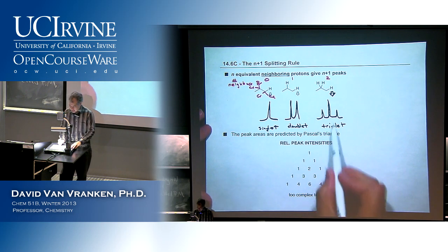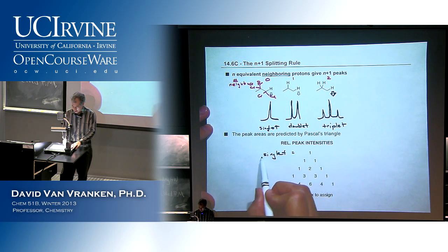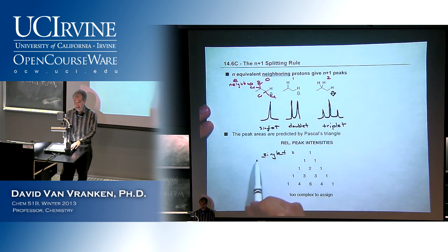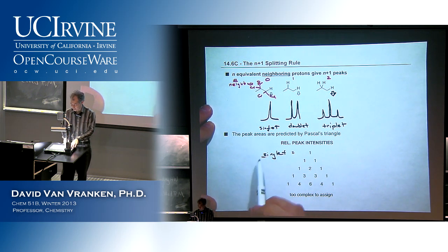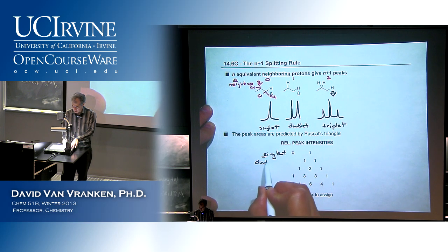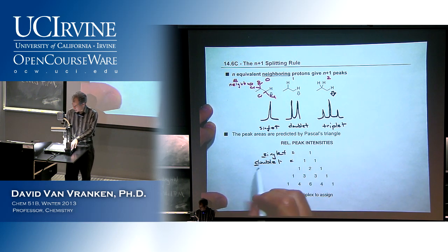Okay, so let's go ahead and talk about these peak area intensities. For a singlet, you don't need to worry about whether it's a 1 to 2 to 1 ratio. A singlet exists as a single peak. And I'm not going to write the word singlet anywhere on any spectrum. I'm simply going to write S, and that's meant to show that the peak is a singlet and not two peaks that are close to each other. When you see two peaks in a 1 to 1 ratio, that could be a doublet, and I'll symbolize that with the letter D. And the two peaks will, of course, be close to a 1 to 1 ratio.